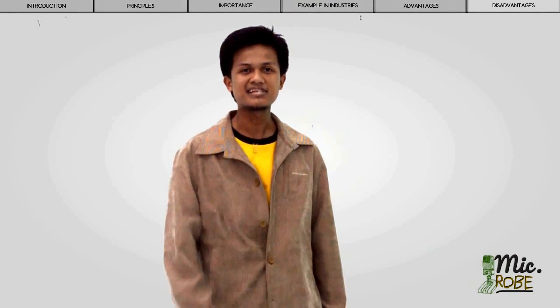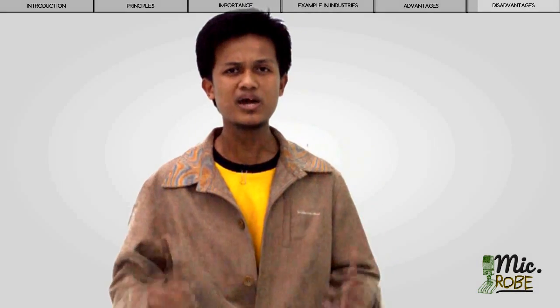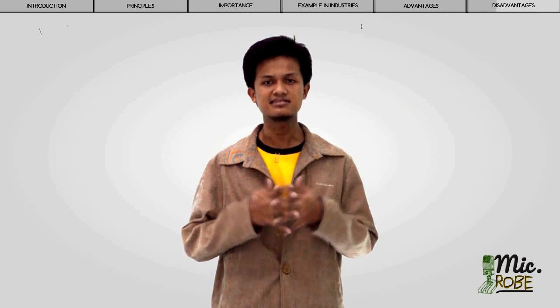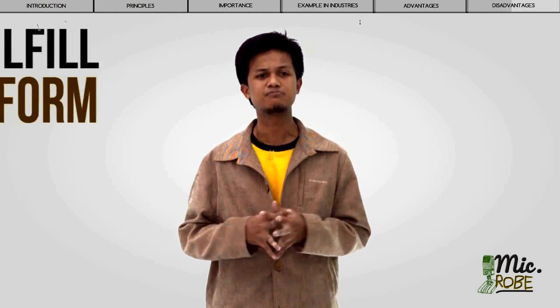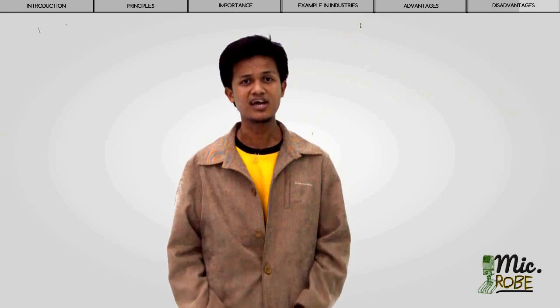Now we enter the second part of my discussion, which is about the disadvantages of bioreactors. First of all, bioreactors are demanding in terms of cost. Why do I say so? Because the initial cost of bioreactors is very high, as these devices are quite expensive compared to the traditional ways. The second disadvantage is that its design involves relatively complex engineering. Thus, whenever the optimum condition is not fulfilled, the cells or microorganisms involved in the bioreactor are unable to perform the desired function. Hence, absolutely, it will affect our results.